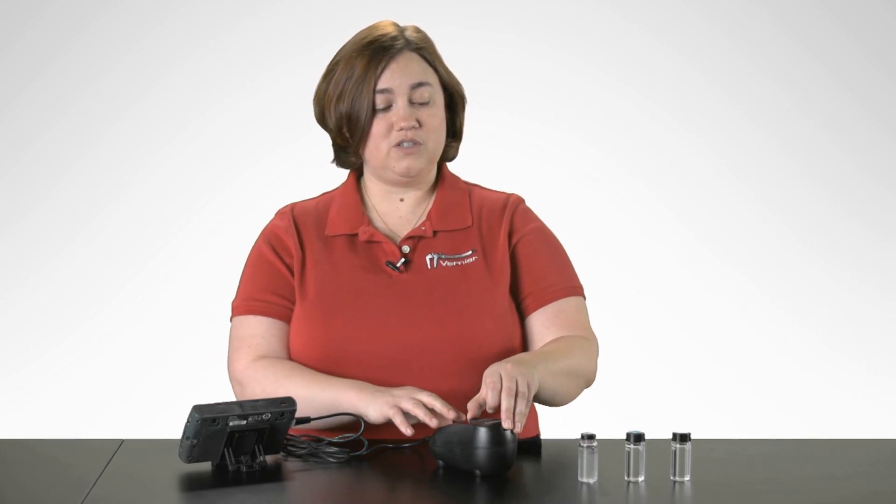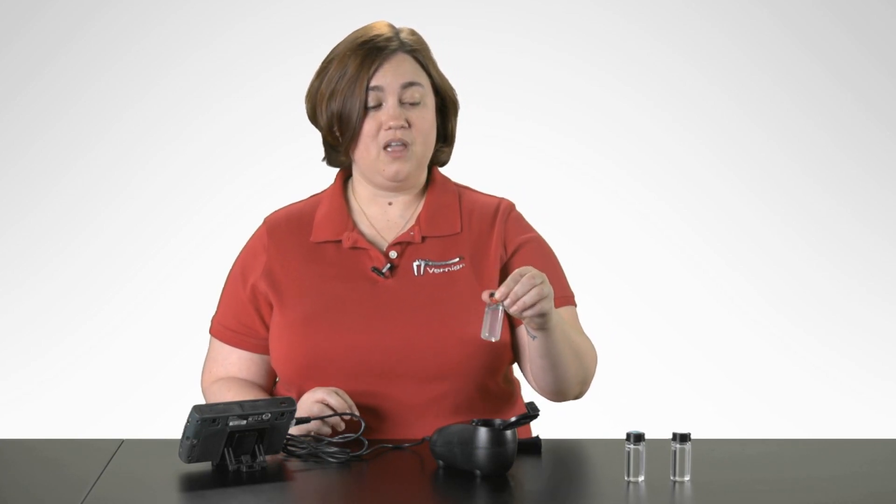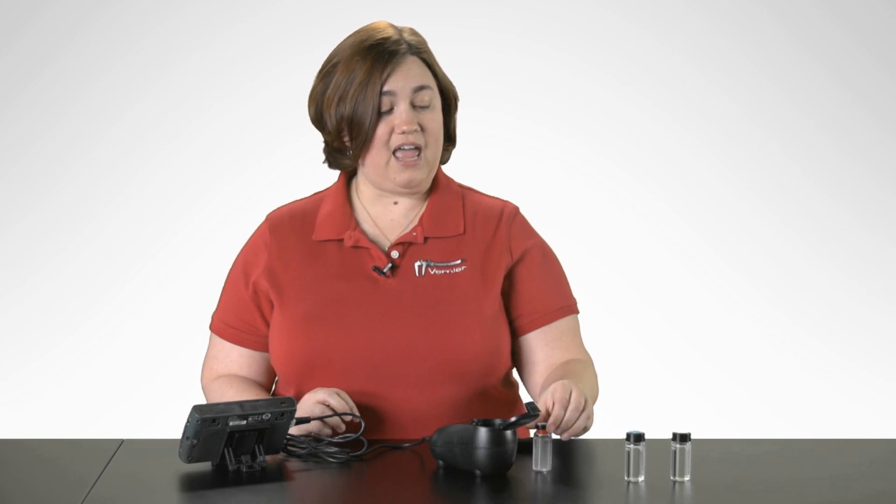First, what I need to do is calibrate my sensor. To calibrate your turbidity sensor, the sensor comes with a 100 NTU calibration standard — this is going to be our first calibration point. You're also going to need to use the cuvette that comes with the sensor and fill that with distilled water for your second calibration point.